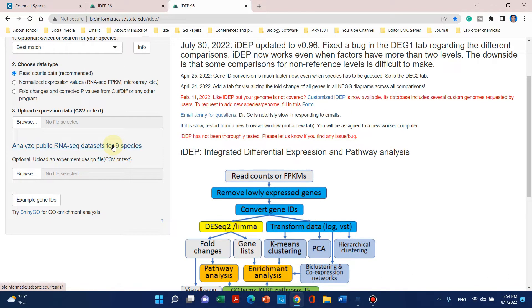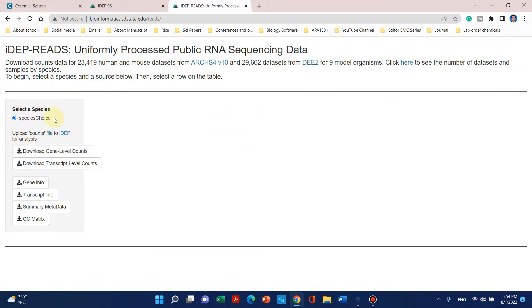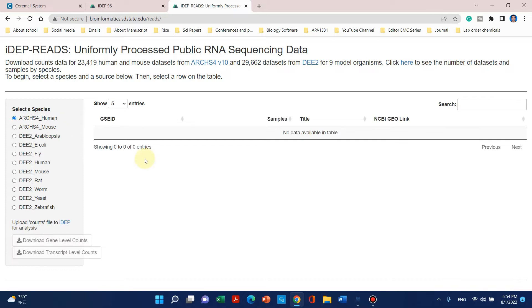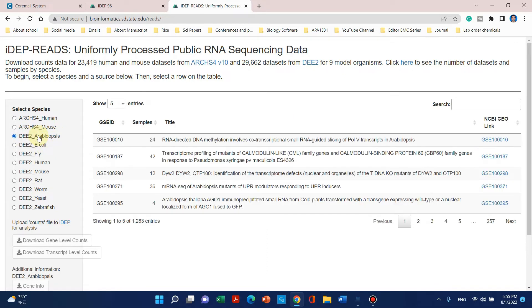This website has integrated nine species and we can select those species one by one according to our choice. The available species are: human, mouse, Arabidopsis, E. coli, fly, rat, worm, yeast, and zebrafish. For today, we will select Arabidopsis.